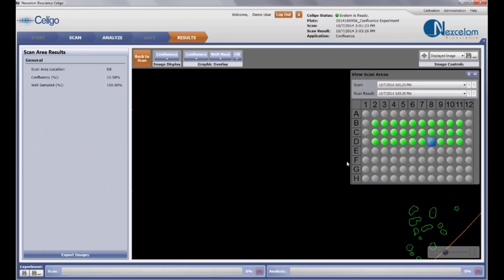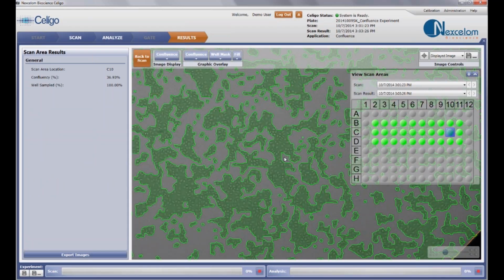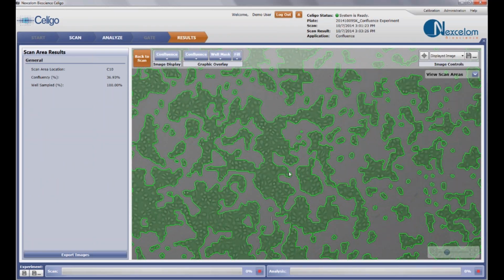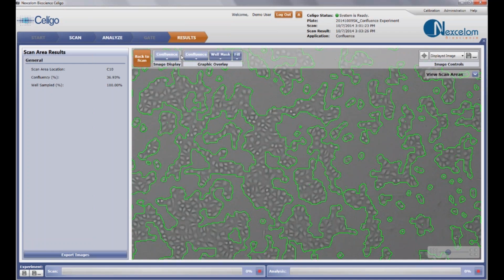And so when you want to export images, there's a couple of different ways. You can select a well in the displayed area, zoom into the location that you like, and now you can see, as I minimize the plate map, I would like to record this in a report so I get the image that I want.